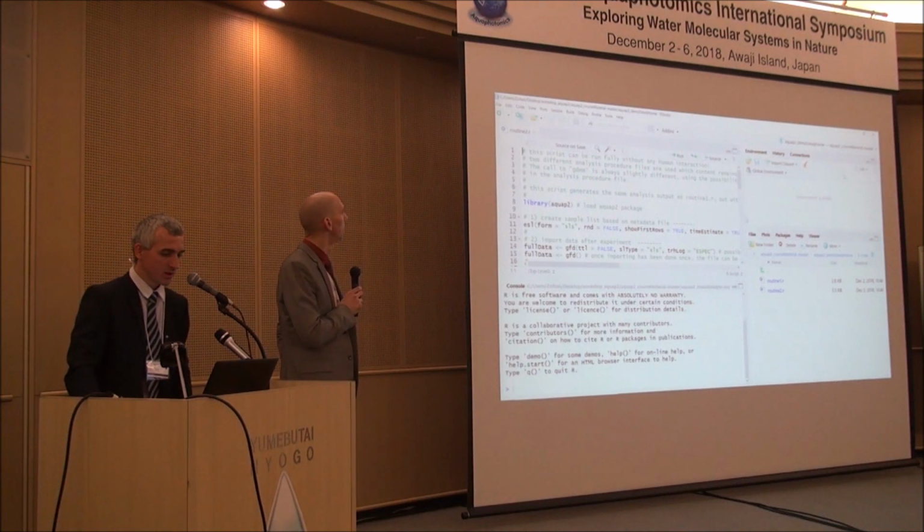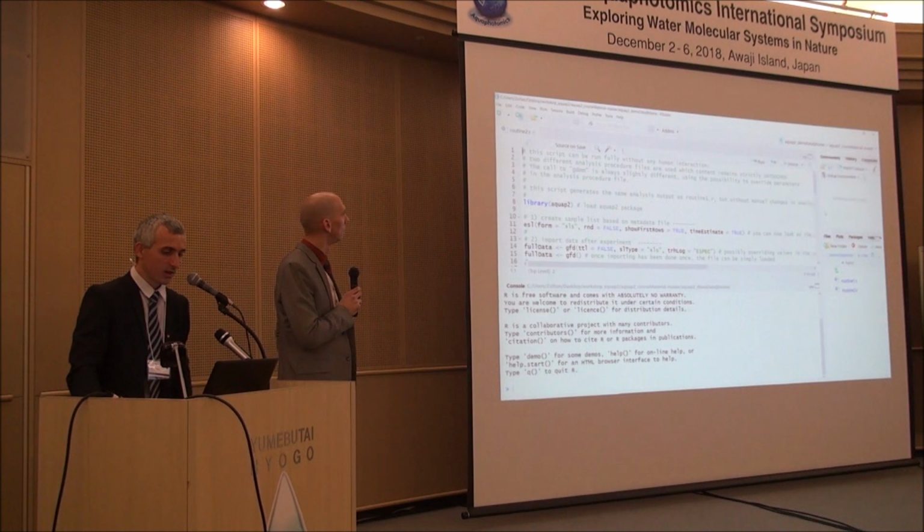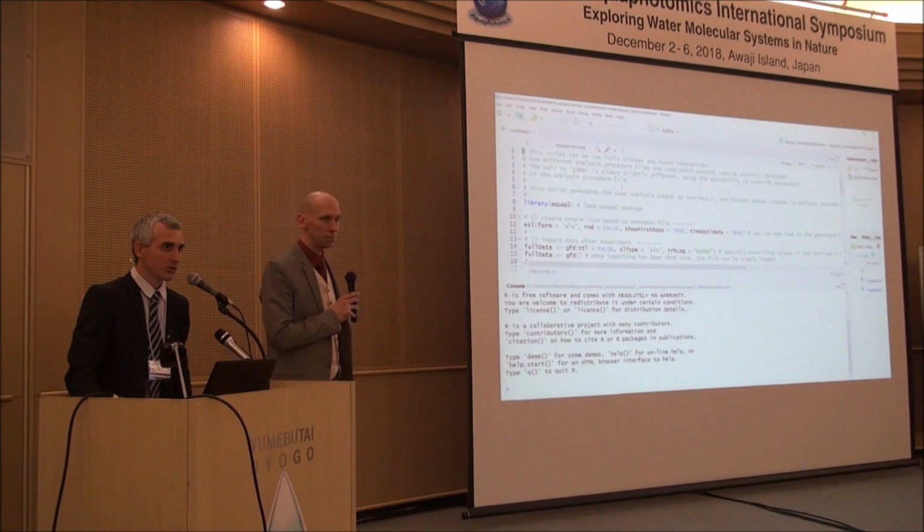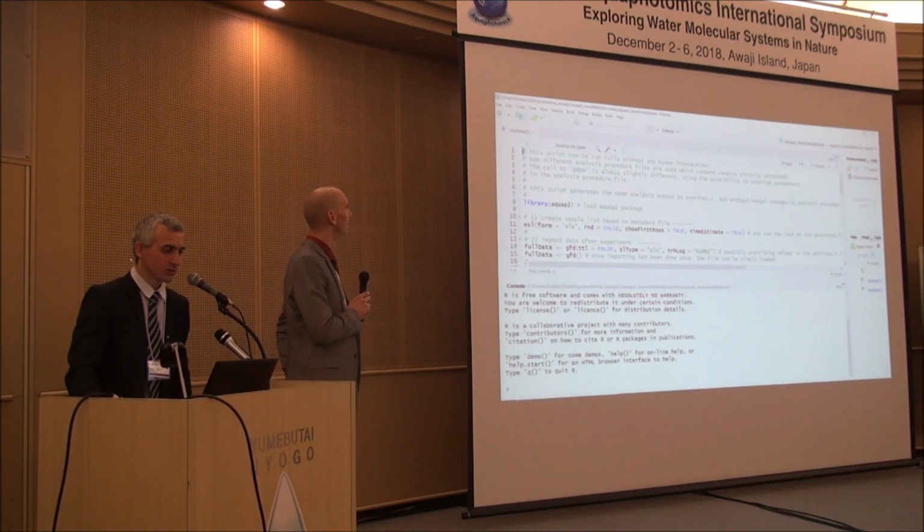What you will see is a pre-written script for the data we provided to do data analysis. Where you see a hashtag, this is a comment. It is not taken into account in the execution by the software; these are comments only for us.